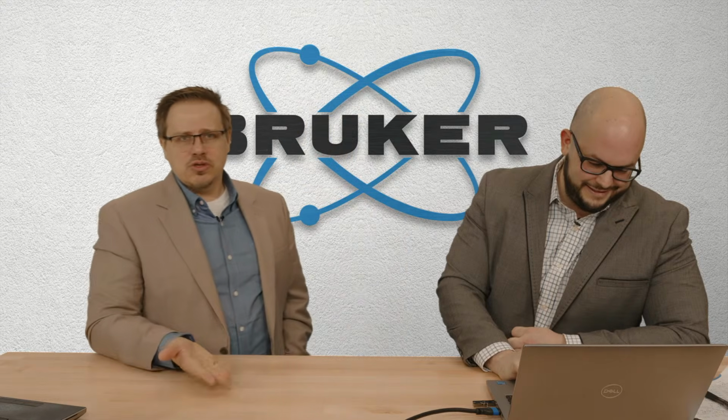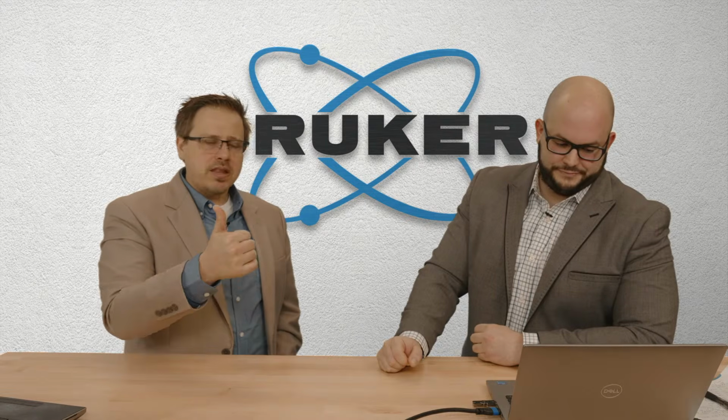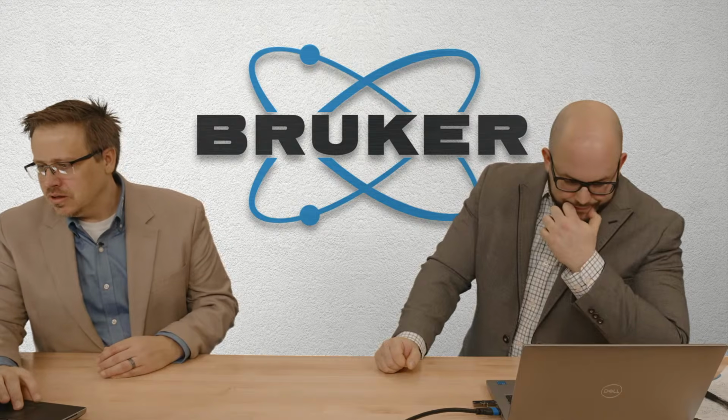So what it's doing is it's looking at that assumption that you should have zero stress pointing out of the sample. And that assumption means that a measurement out of the sample gives you the correct d-spacing, because we would expect a shift due to Poisson ratio. But if it deviates from that expectation, that's where the hydrostatic stress comes in.